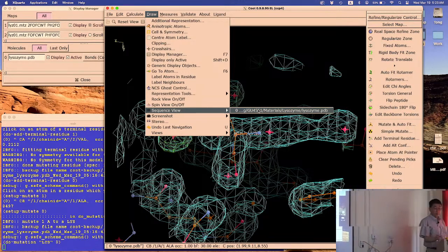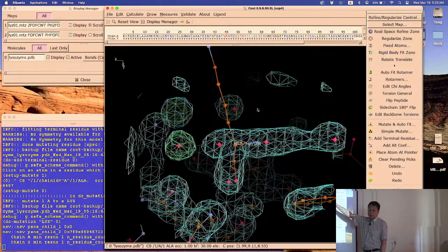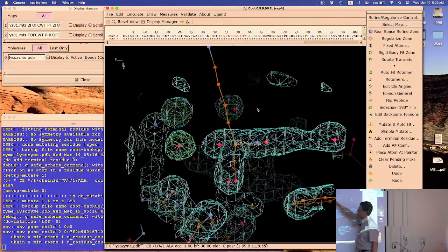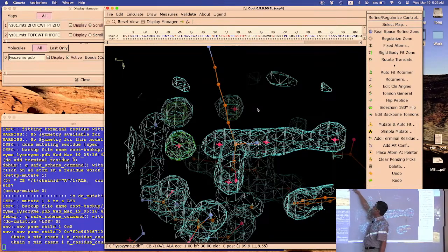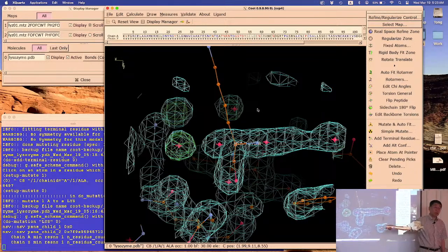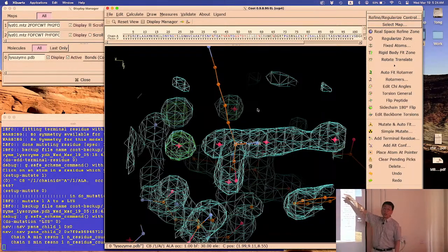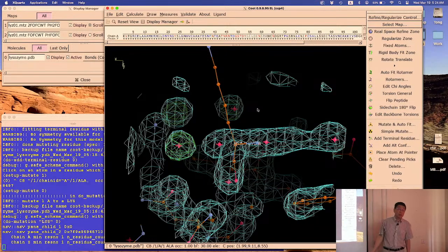Okay? So now you should have the sequence on top. And then you can just go to residue 2, or in this case 1, but anyway, 1 or 2. You can go there, click on that, you're right there. Okay, if you're lost somewhere, you keep this up there. You can go anywhere you like. Okay?